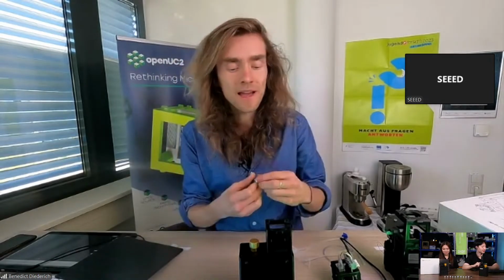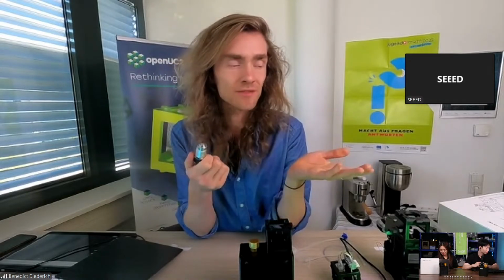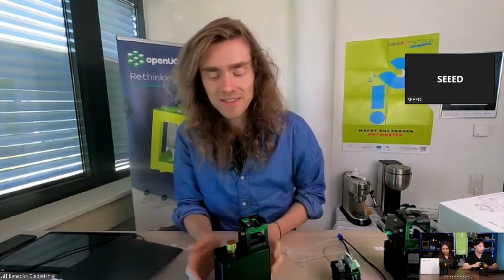That's the advantage over any of the USB microscopes: you can swap these lenses. You just unscrew it and then you order other lenses online. You can, for example, have a simple 4x lens, which doesn't sound like a lot, but if you magnify a micrometer to become 4 micrometers and your pixel size is like 2 micrometers, then you can actually see something in that region. If you have a 100x lens, then you obviously can magnify more. So that means you cannot really zoom, but you can magnify. And that's the idea of microscopy.